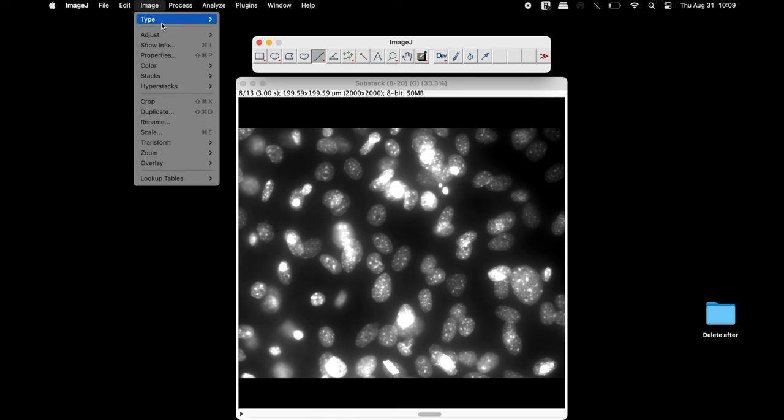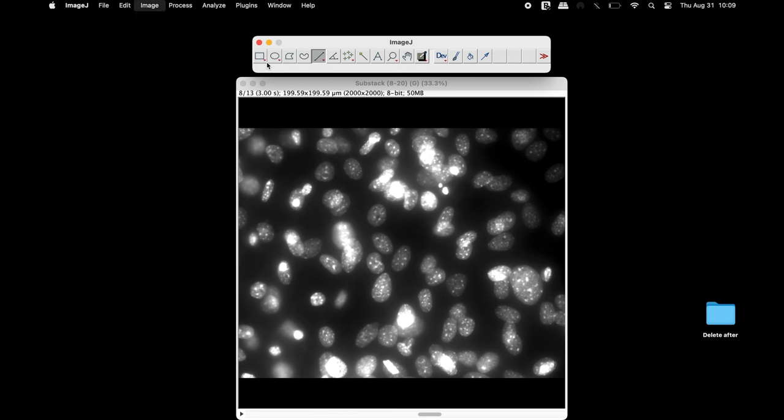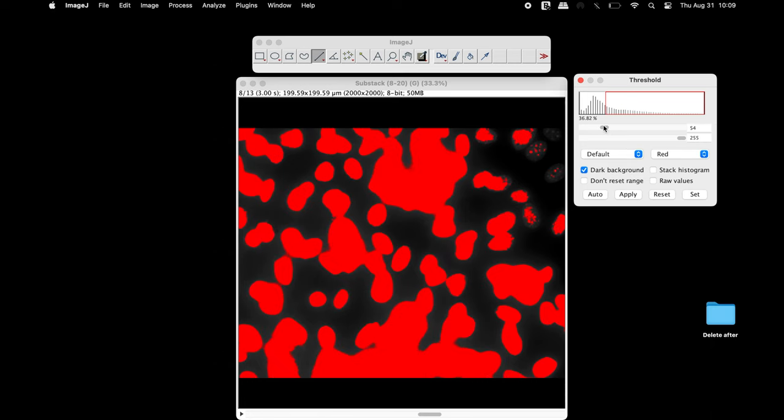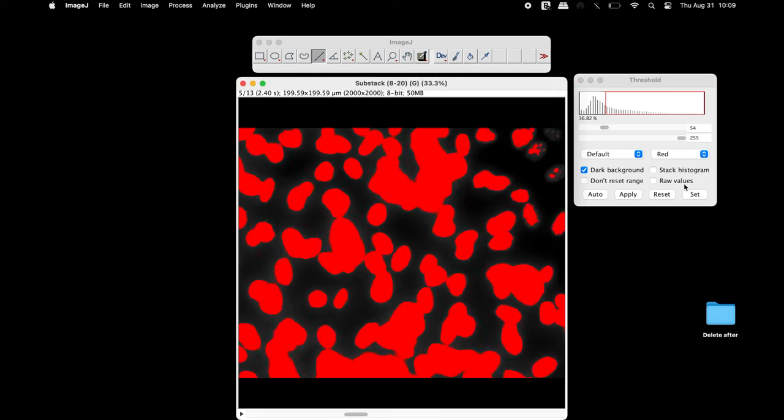Next, adjust the threshold. The threshold needs to be adjusted such that all the nuclei are red in color in all the slices in the image.